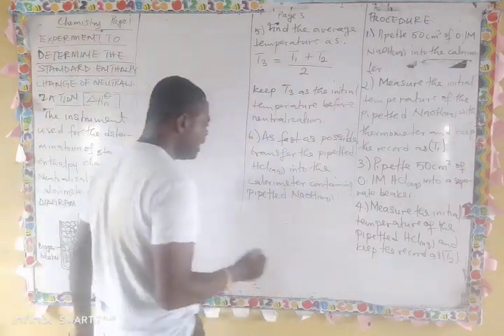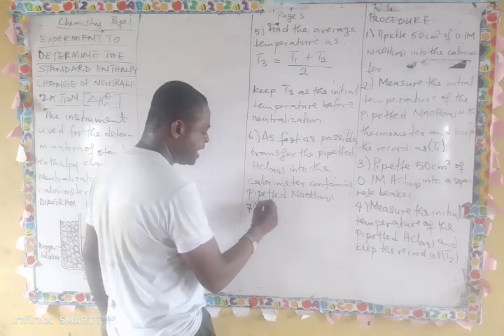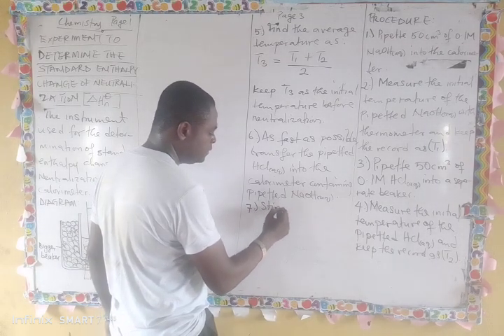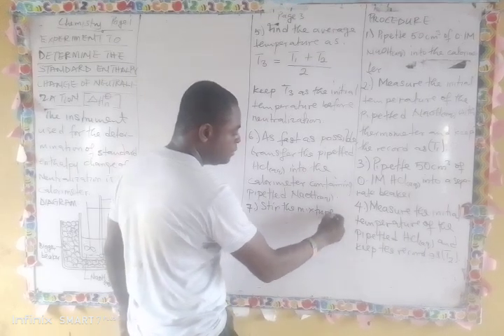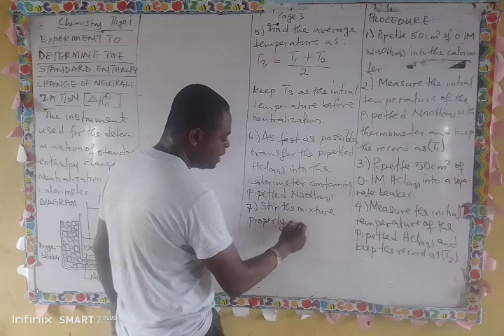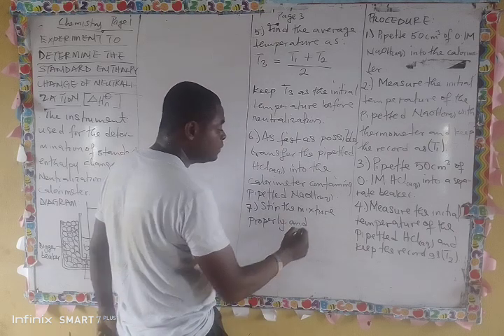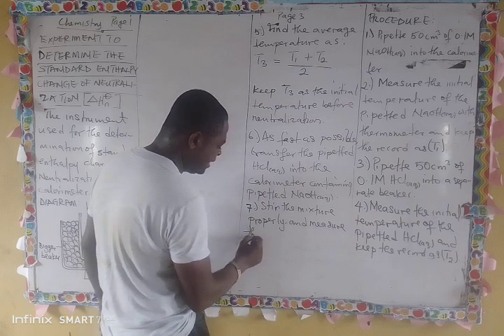So now, what do you do? Step 7. Stir the mixture properly and measure the final temperature.